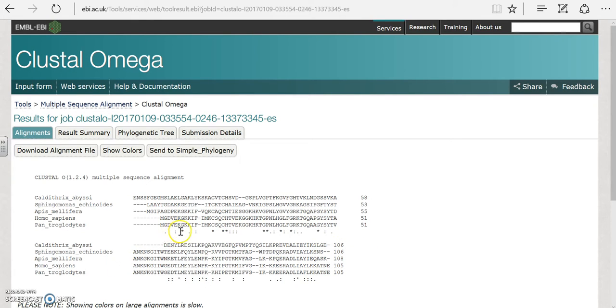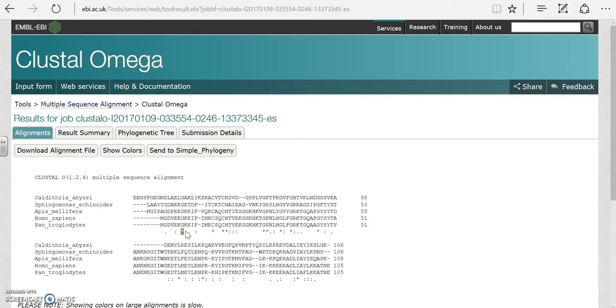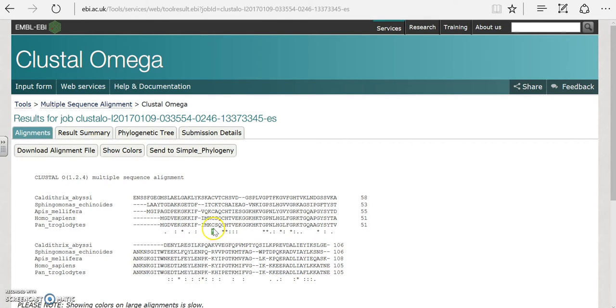Notice here that we have some asterisks. The asterisks represent amino acids that are identical in this particular position. For example, here they are all G. At this asterisk notice at this position all the amino acids are C and so on.